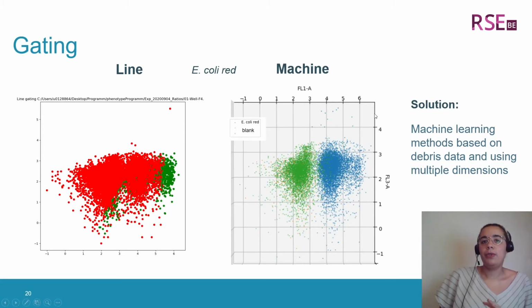The program used a sample containing only medium debris to identify debris in all samples containing cells. This method gets rid of the manual gating information, so it can work with all cytometers and all cell types as soon as the user furnishes the medium information.